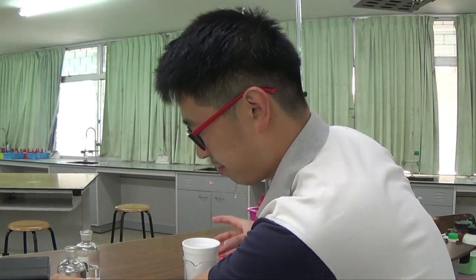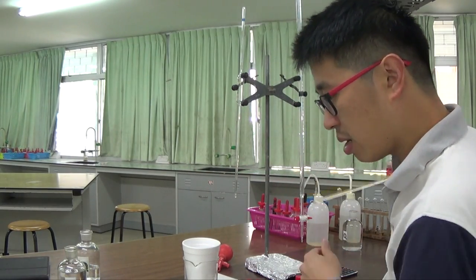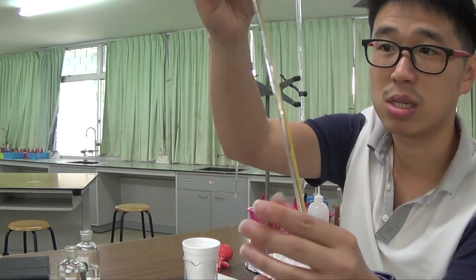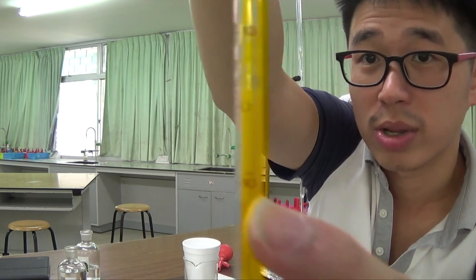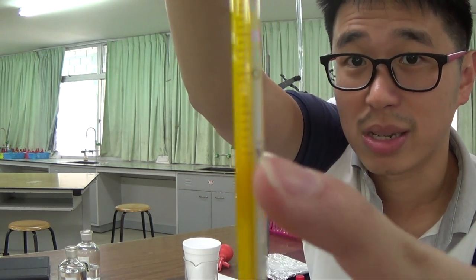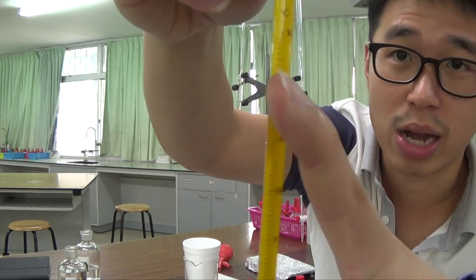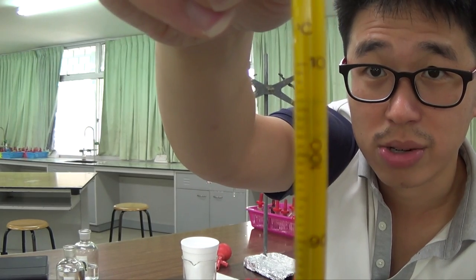So what next? Measure the temperature of P. P is in here already. So this is my thermometer. This thermometer reads from minus 10, I think, it's very blurry the way I see it, all the way to 110. So there's 100 and then there's 110.